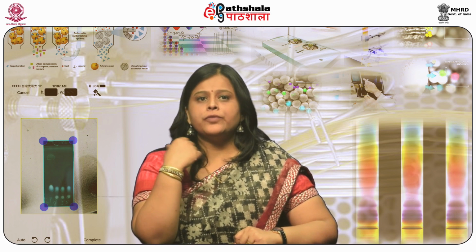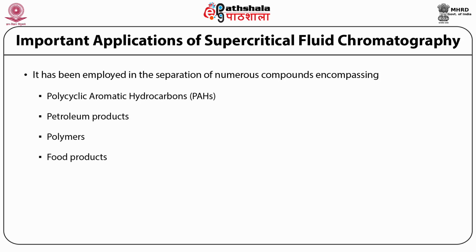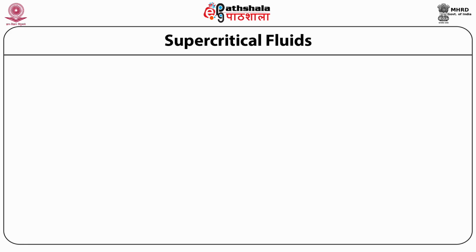In 1982, Hewlett-Packard introduced a second instrument for SFC. With the continued efforts of the scientific community, SFC today is an established technique for many different types of applications. It has been employed in the separation of numerous compounds encompassing polycyclic aromatic hydrocarbons, petroleum products, polymers, food products, cosmetics, and pharmaceuticals. To understand the formation of a supercritical phase, we will consider a phase diagram of a substance.